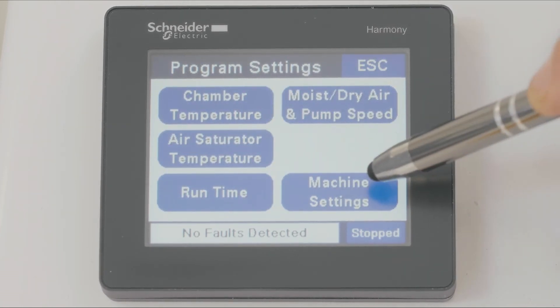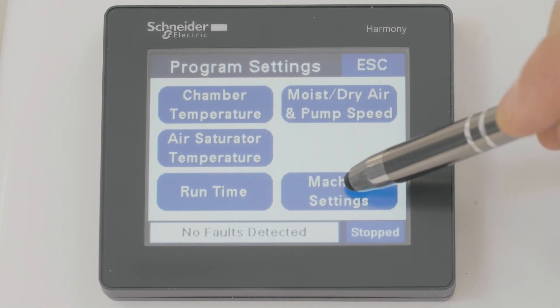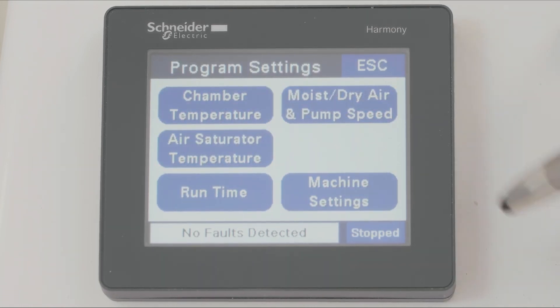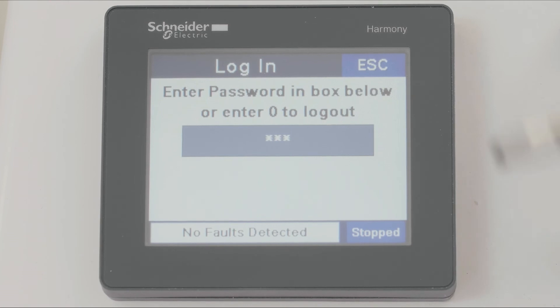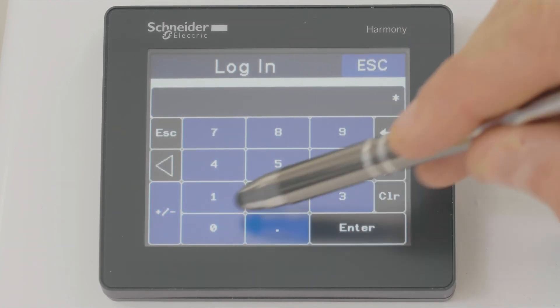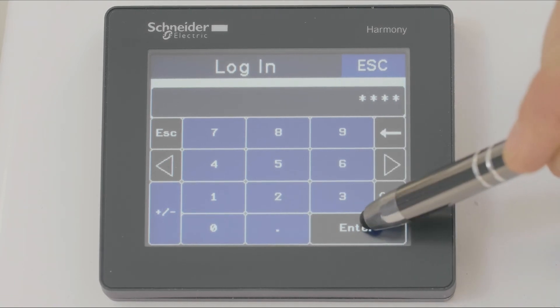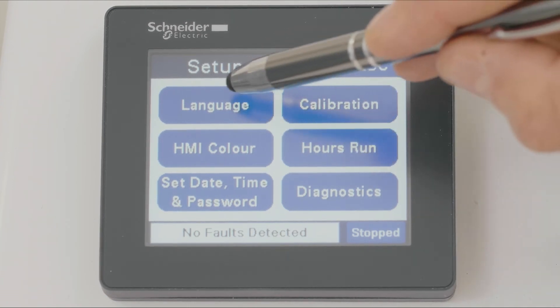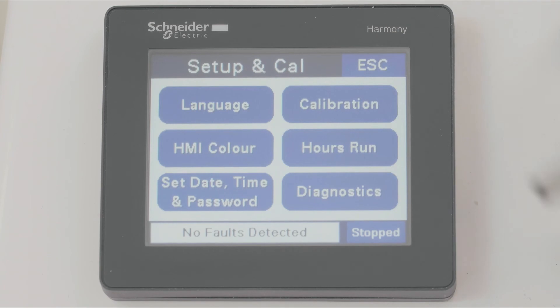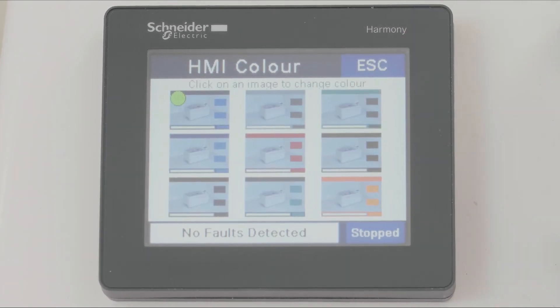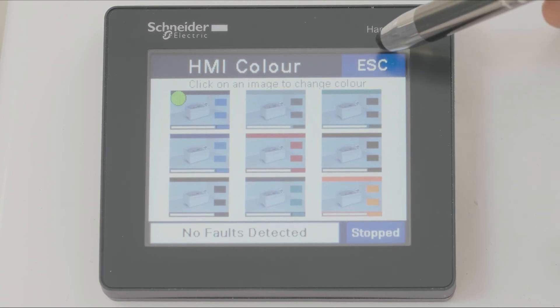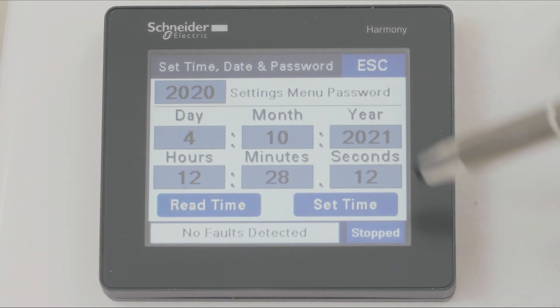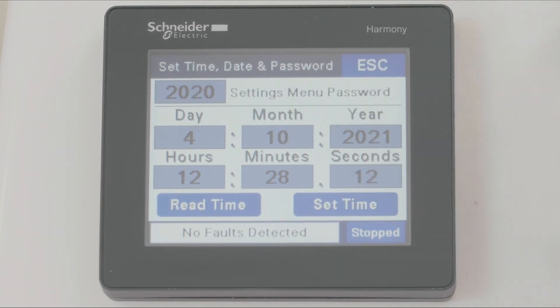And we can access some further menus within the machine settings area. If we access the machine settings area, we would type in a code of 2020 and enter. Here we can enter the setup and calibration area of the chamber where we can select the language. We can select the HMI color and change the background for the screen. We can set the current date and time, make our adjustments and press set time.